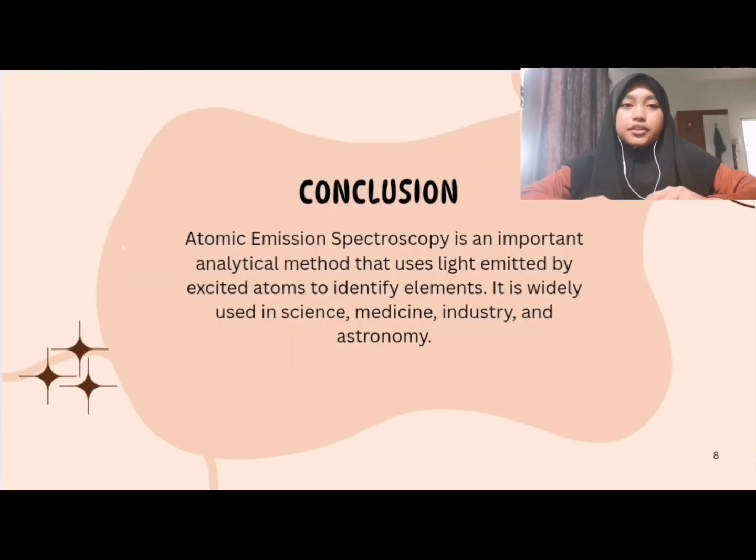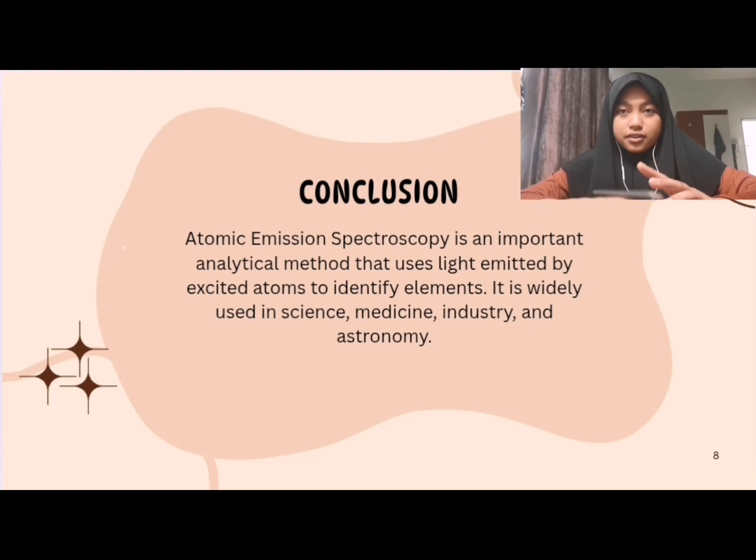AES is an important analytical method that uses light emitted by excited atoms to identify elements. It is widely used in science, medicine, industry, and astronomy.